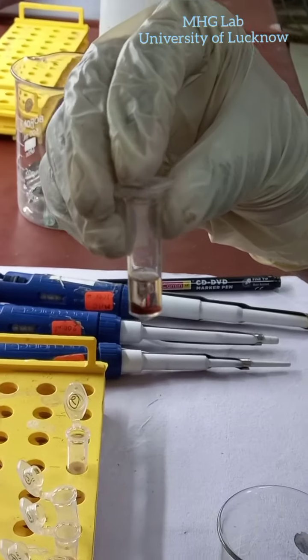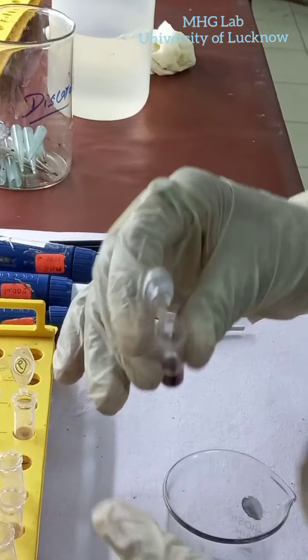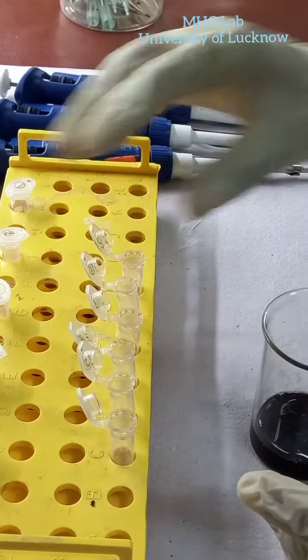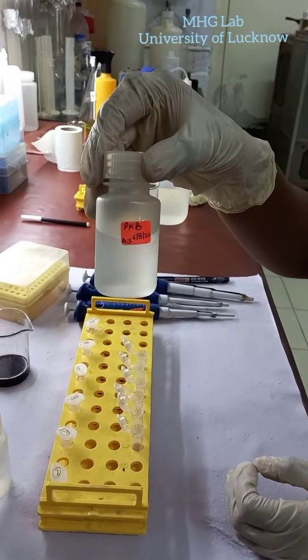The centrifuge and washing steps have been completed. Now we will discard the water. I have already discarded the water from the other samples. Now we will put Proteinase K buffer, that is PKB buffer, into it.